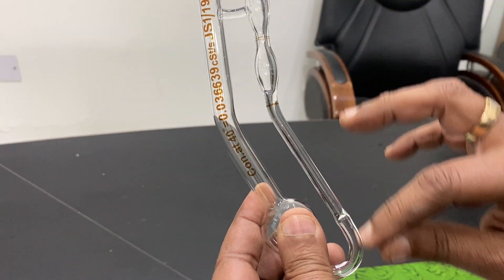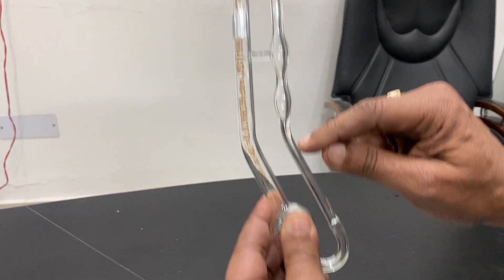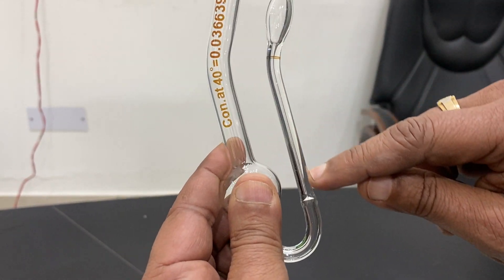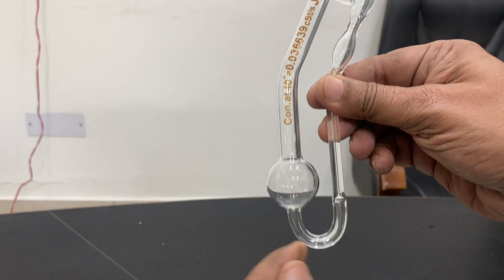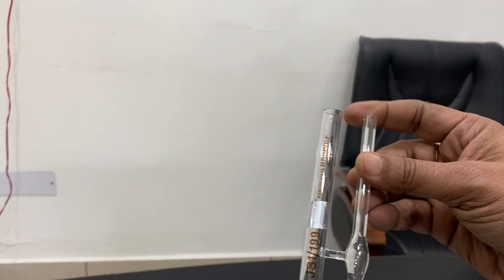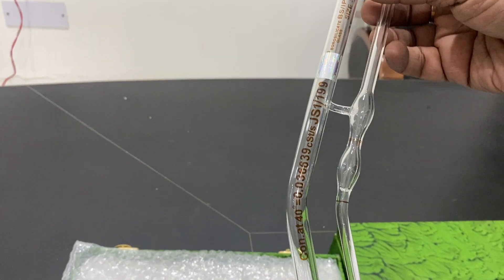This viscometer is designed for transparent liquids. The liquid passes from one end through the capillary, and you can see the capillary clearly. The solution then flows into the lower chamber. It is very easy to use — scientists and lab users will be familiar with the procedure.